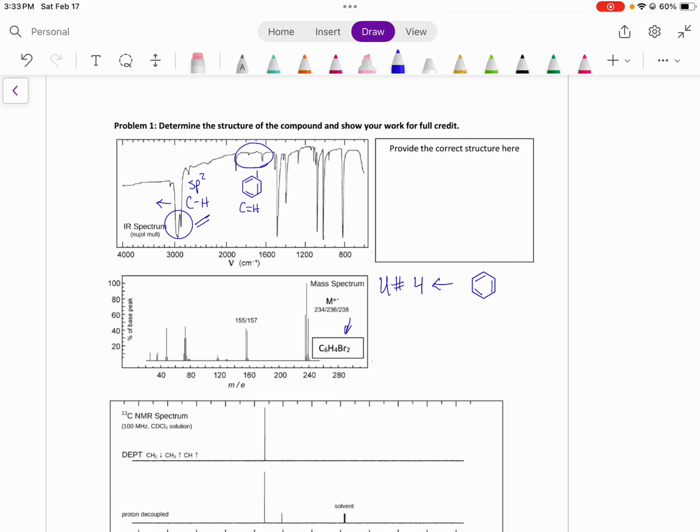But we've got some dipole situations with 2 bromine, which just kind of make this whole signal here wonky. Its absorbance is much lower. You do see this little peak here around 3100, which is what we would expect. We would just kind of expect it all to be shifted over a little bit more, which is fine. Bromine makes IR spectrum weird.